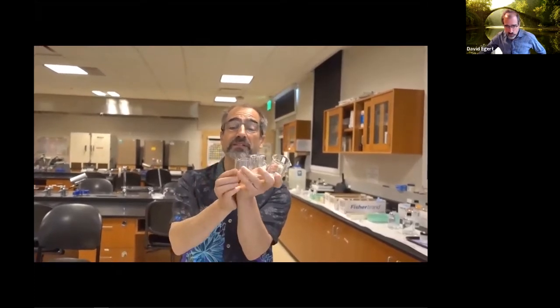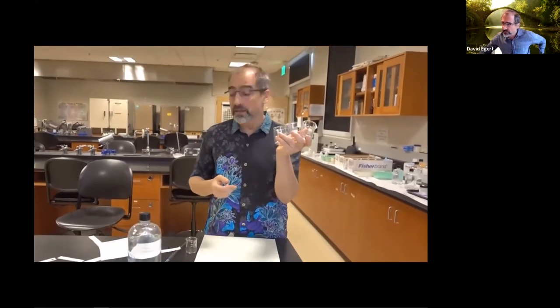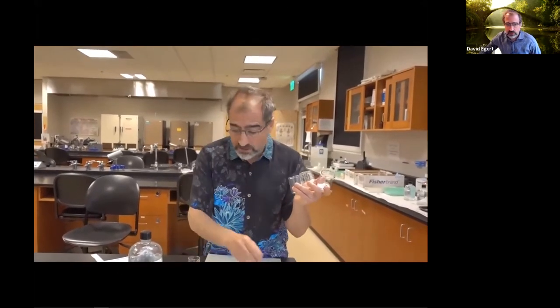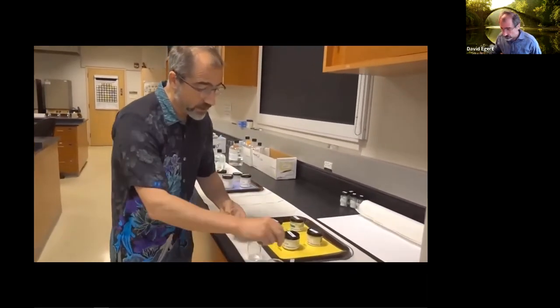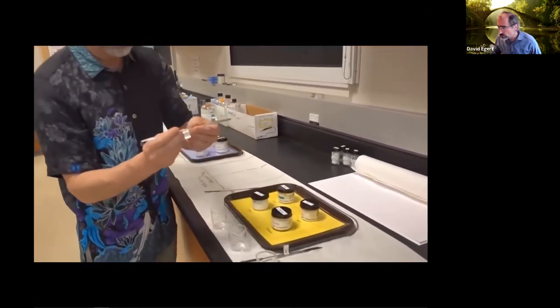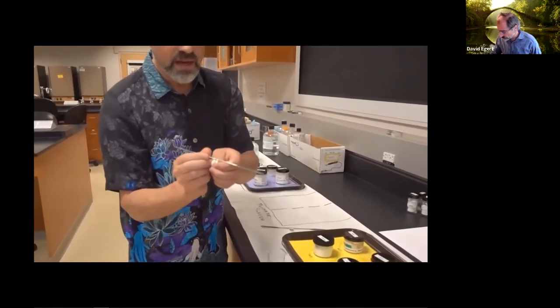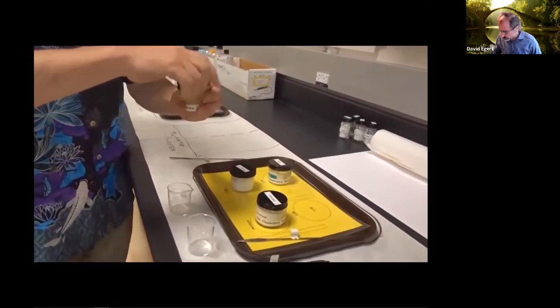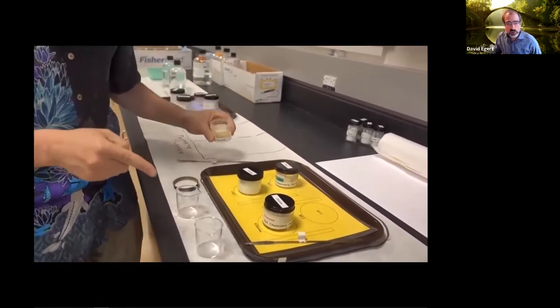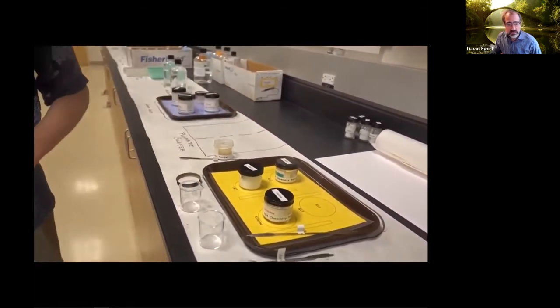A pinch is basically what it sounds like. There's a picture in your lab book showing a little bit. It should be enough that you can actually see it, but not so much that it's not going to dissolve in a little bit of water if it wants to dissolve. So we can come over here, and each of these spatulas is labeled so I don't cross-contaminate between the different things. And I also want to make sure I mark what these are.